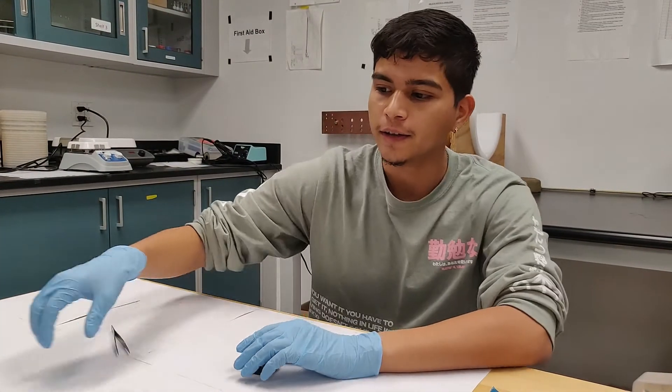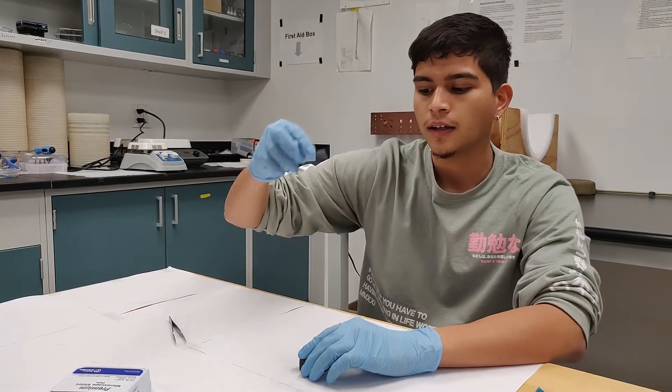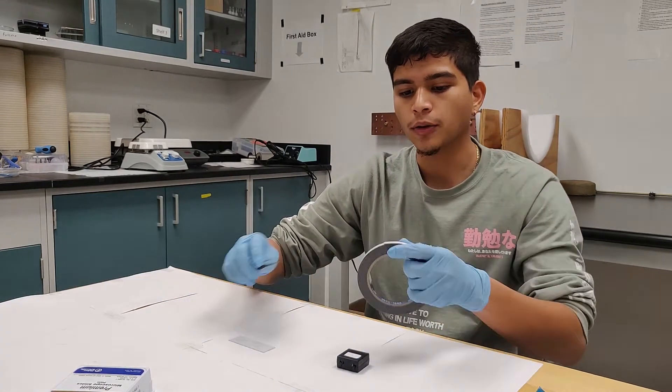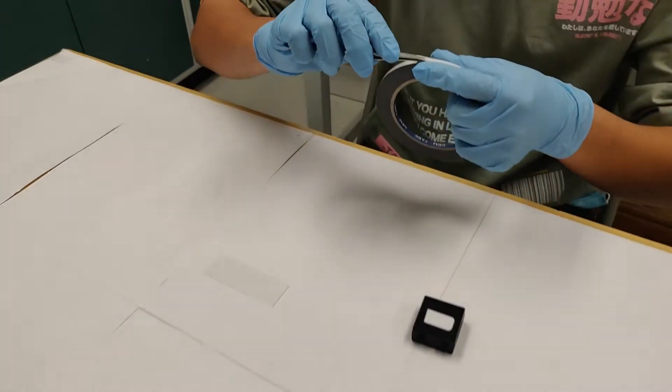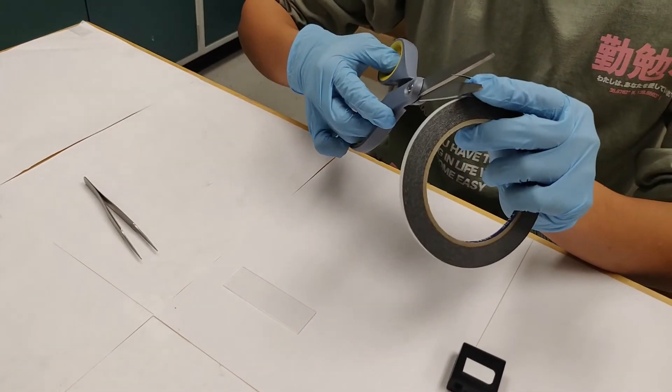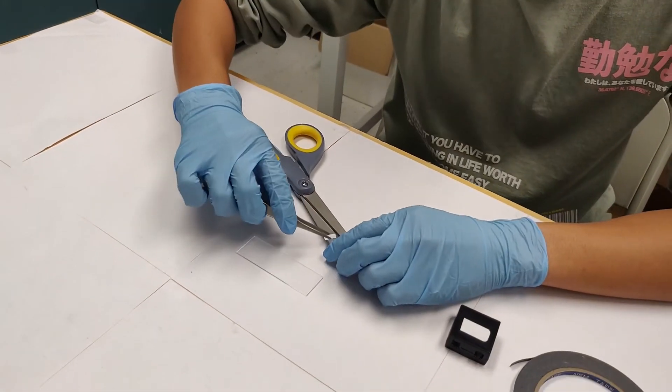So to get started, the first thing you do is get a microscope slide. This is what you'll put your substrate on. And to hold it in place, you want to get a piece of carbon tape. Cut it to about the size of the substrate, then place it on your slide.